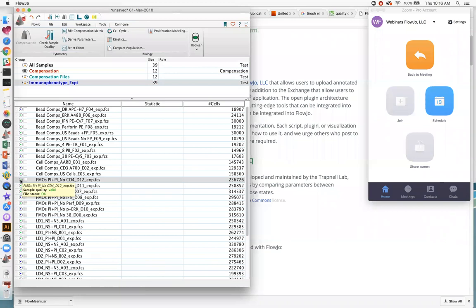So you could get a spike in the data because of a clog, right? A lot of times if we don't filter our samples before we add them on the cytometer, right? A lot of times bubbles will actually trigger the purple or the red dot.